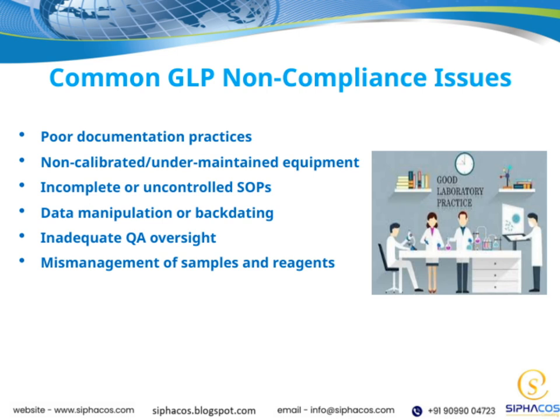All of these issues highlight the importance of strict adherence to GLP standards. By understanding and avoiding these pitfalls, we can ensure our data remains credible and compliant with regulatory expectations.